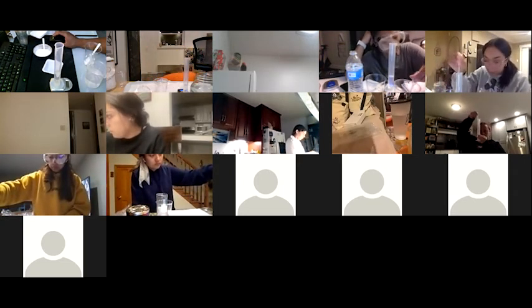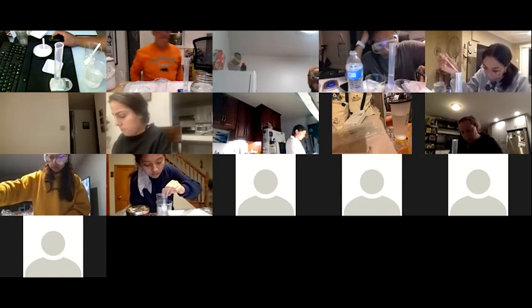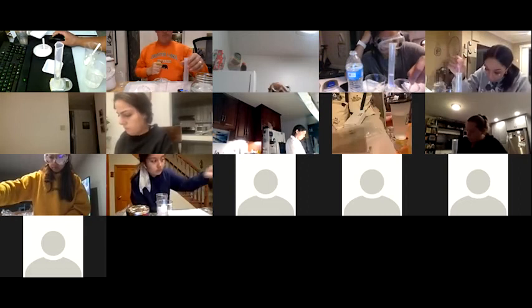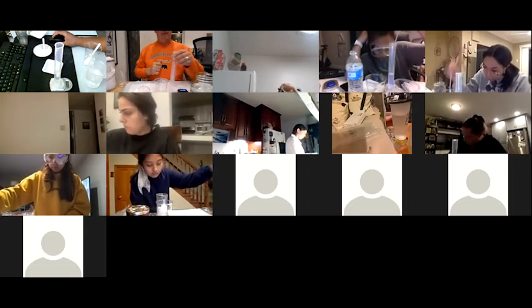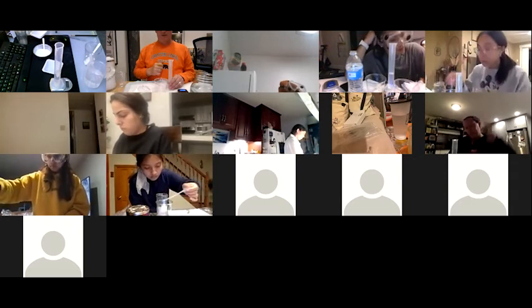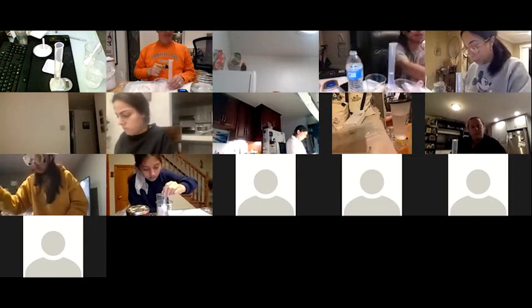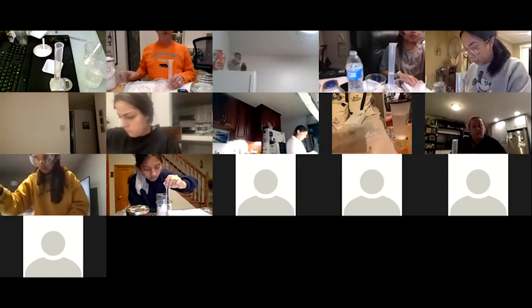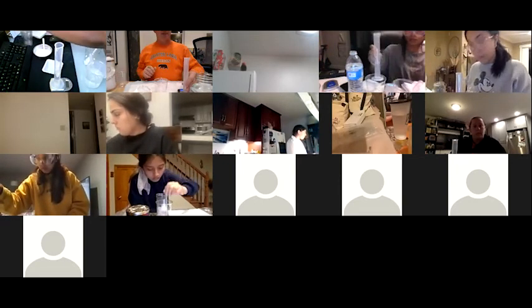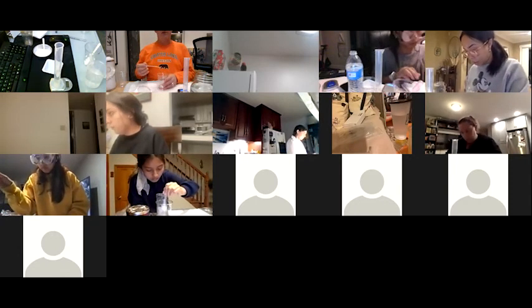When you're trying to tare the scale, I'm trying to tare all of the plastic cups. So when the cup is on the scale, do I press tare? Yeah, you hit tare, because basically what it does is subtract the mass of the cup. But you don't do them all at once.